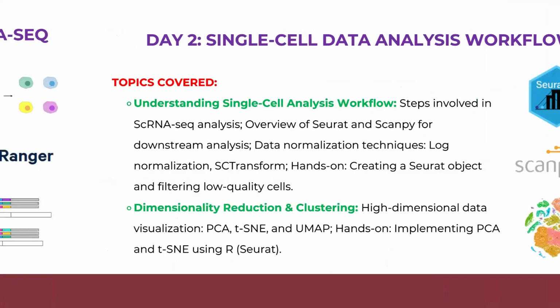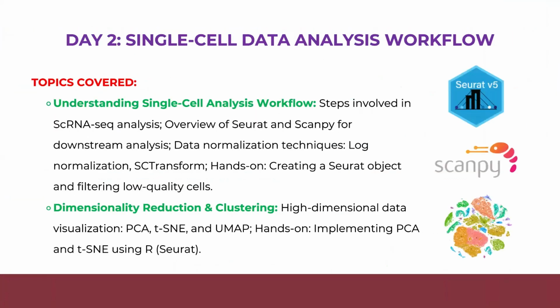Day two is going to be about dimensionality reduction and clustering, which tells us about the data analysis workflow. On day two, we are going to make sense of the complex data. We are going to dive into dimensionality reduction using PCA, t-SNE, and UMAP, then perform clustering to identify distinct cell populations. Here you will discover hidden structures and relationships between the cells like never before.